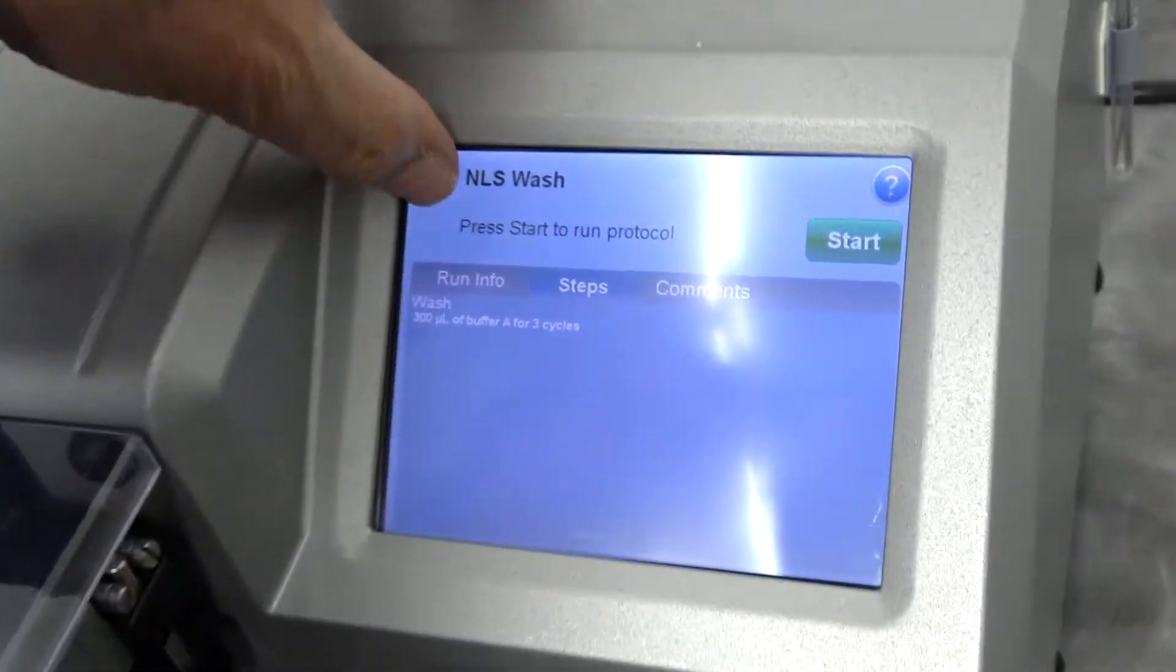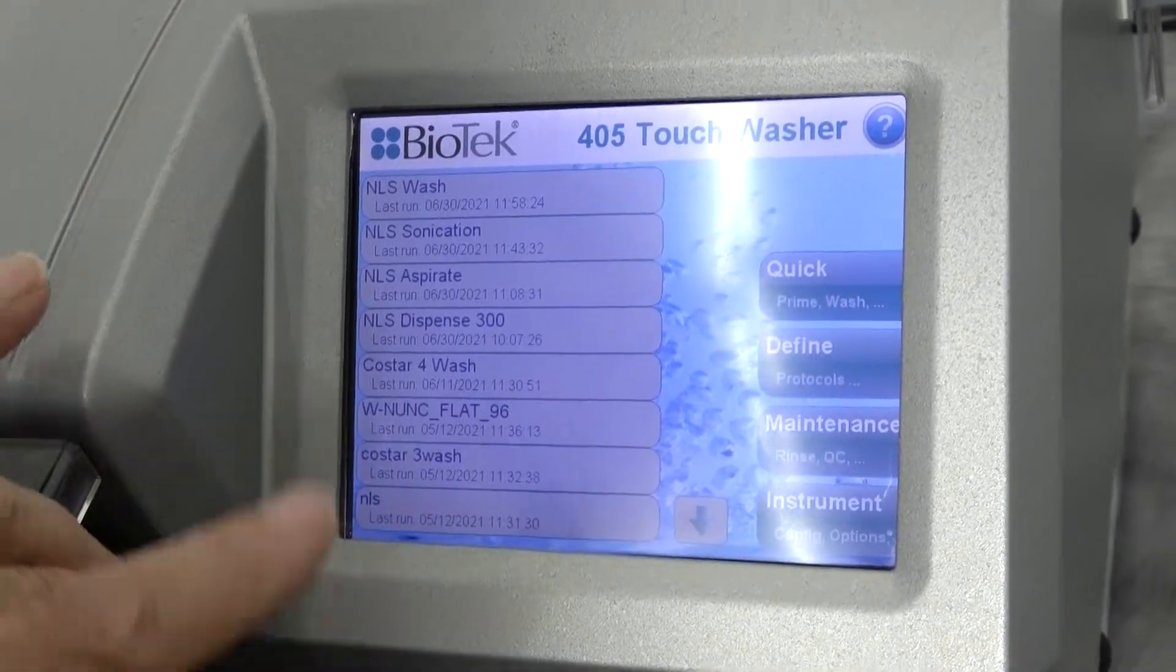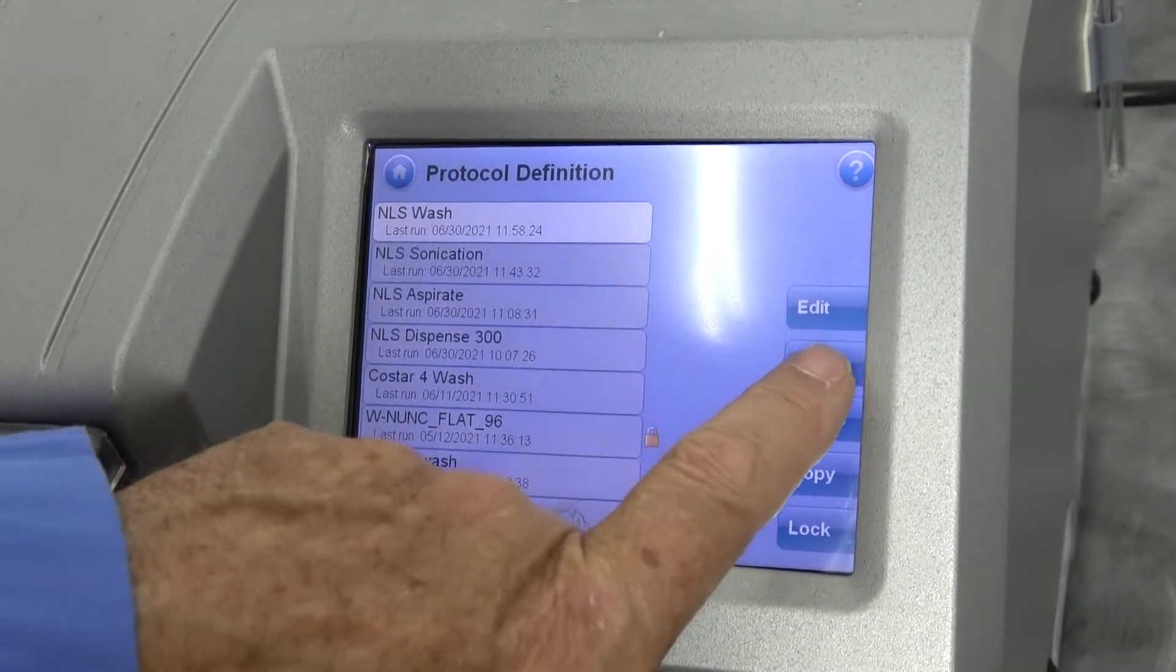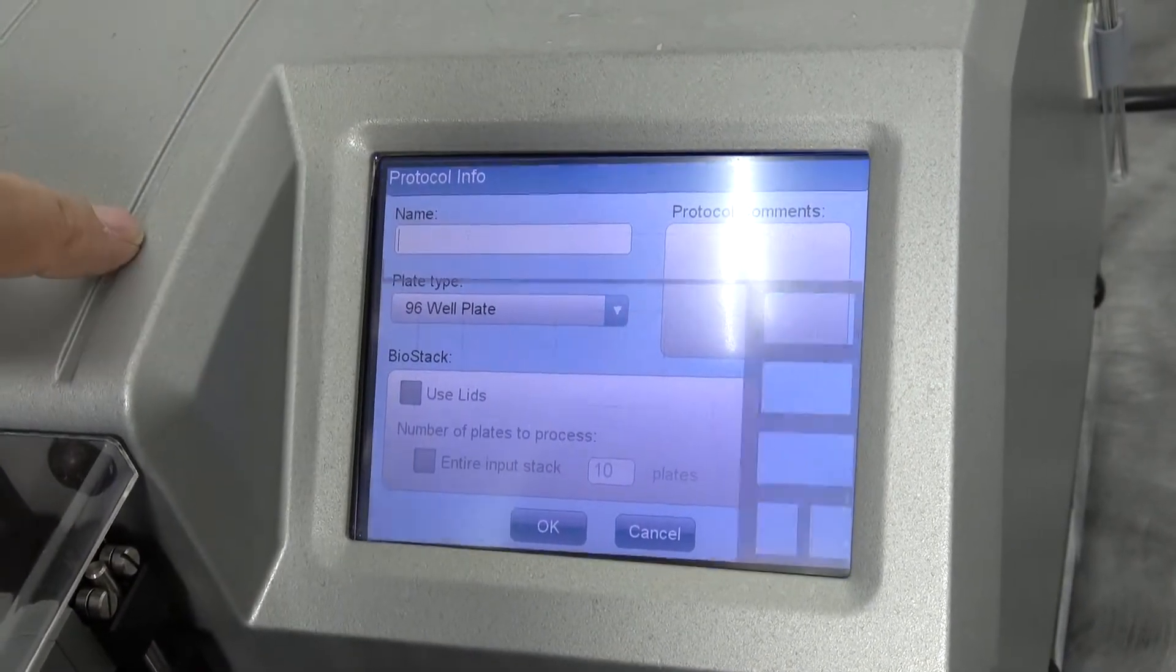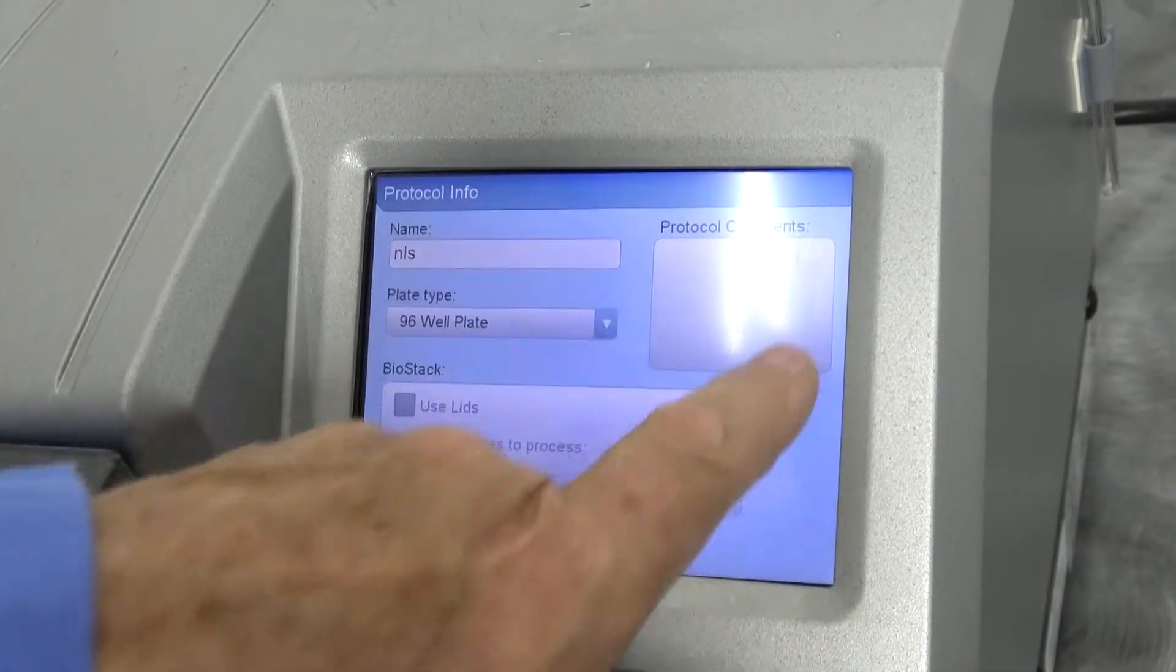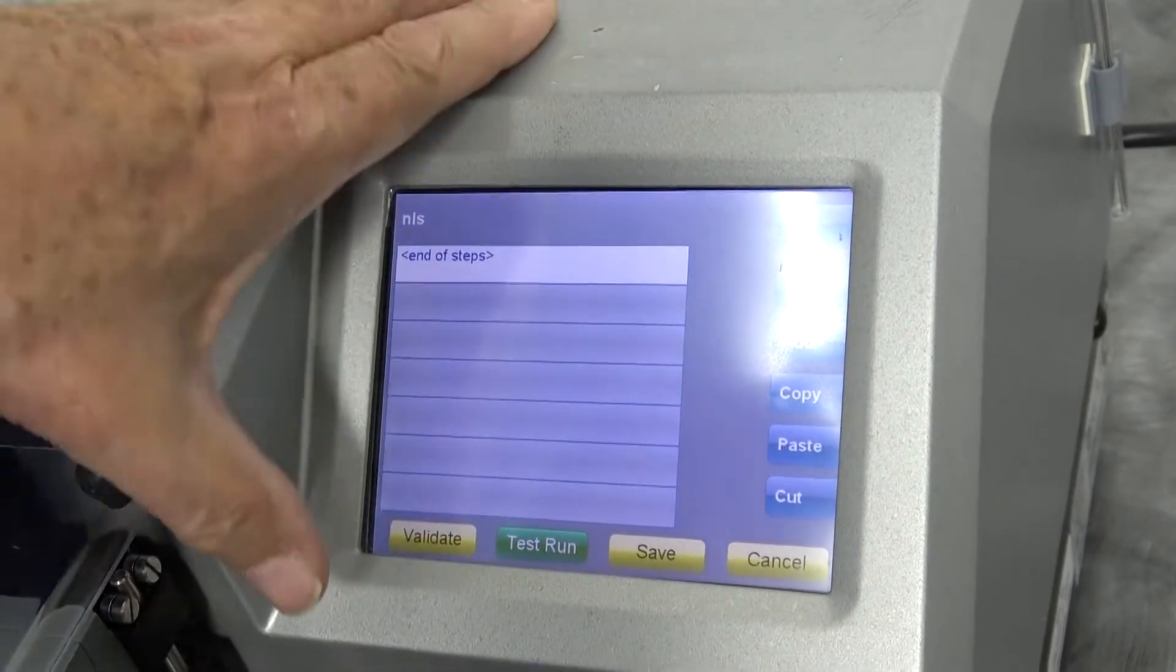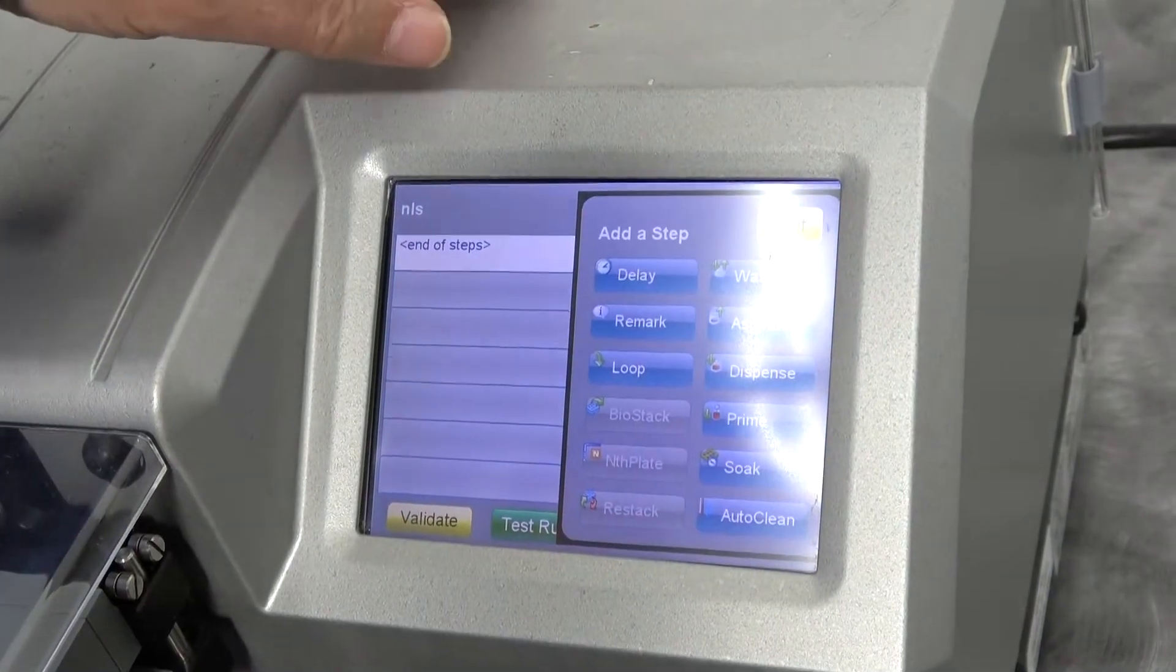We're going to take this back to the home screen. It's a touchscreen, so we all know how to run it. If we want to create a new protocol, we're going to define. We're going to create. We'll give it a name. Touchscreen comes right up. Let's just give it NLS. We can give it a very in-depth name. You can give it instructions. Here's where we're starting our list of programs. We tell it we want to add a step into it.